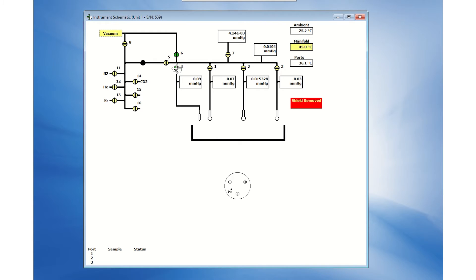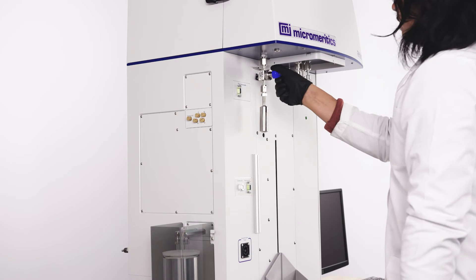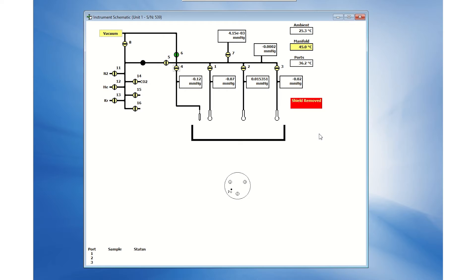Once the space is evacuated sufficiently, when the pressure reading is close to zero, close valve 4 on the schematic and open the shutoff valve. You will notice a pressure increase of several hundred millimeters in mercury on the schematic once the shutoff valve is opened.